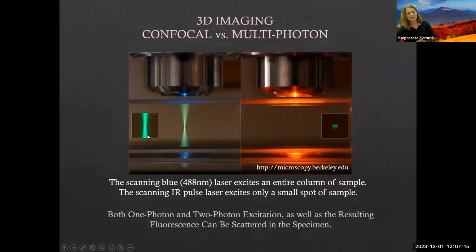Let's say that I illuminate the fluorophore in this cuvette with a blue laser, and I would like to image only one focal plane of this volume. In wide field fluorescence microscopy, this cone of out of focus emission generated above and below the focal plane makes the image very blurry and doesn't allow us to image details of interest.